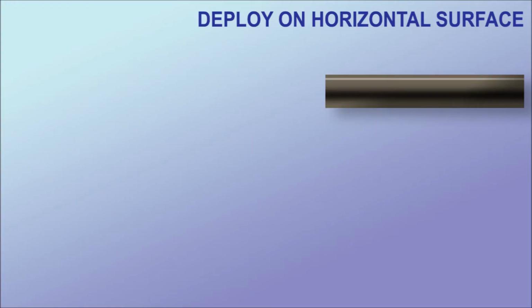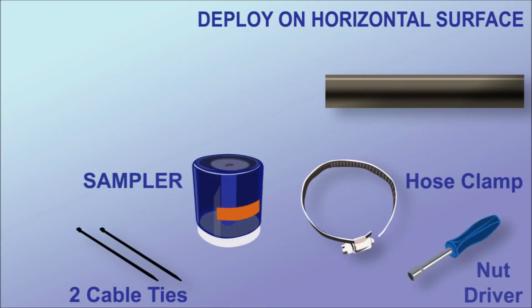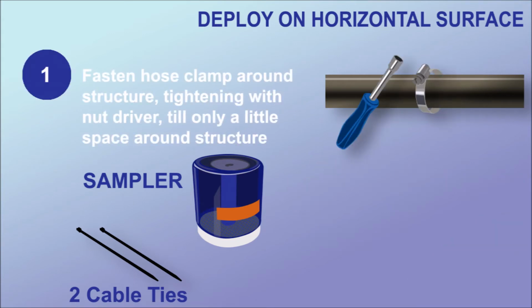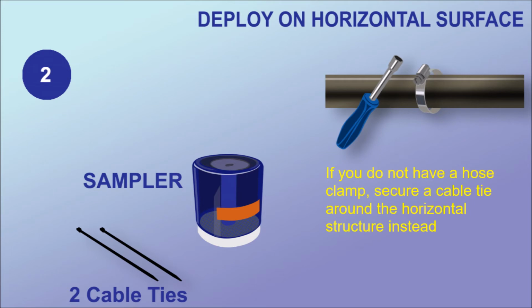To deploy the sampler on a horizontal surface, you will need two cable ties, a sampler, a hose clamp, and a nut driver. First, fasten the hose clamp around the structure, tightening with the nut driver until there is only a little space around the structure. If you do not have a hose clamp, secure a cable tie around the horizontal structure instead.